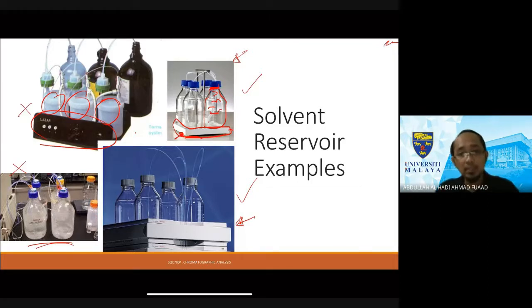If you have a containment, then you can localize the spillage, thus reducing the hazards that can occur in your lab or at your company. In contrast, if you have an open system with no secondary containment, if it spills or someone accidentally knocks it down to the floor, then that's it.